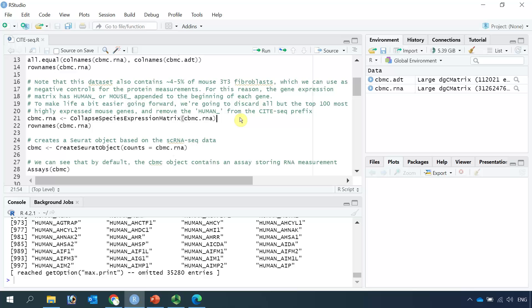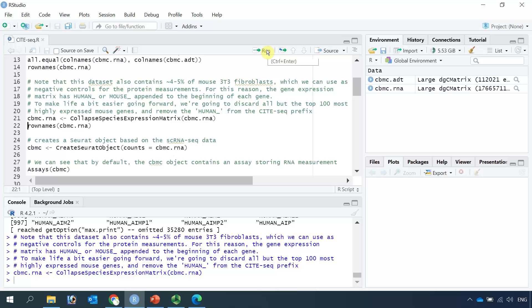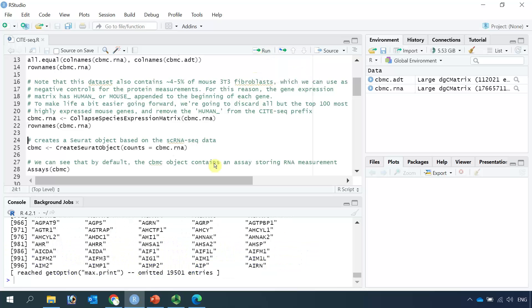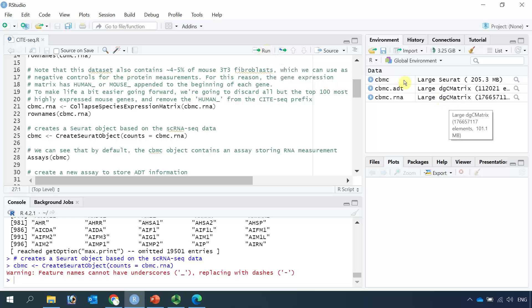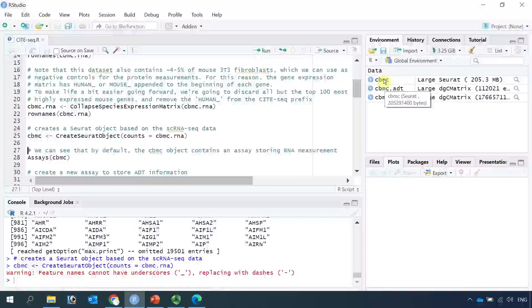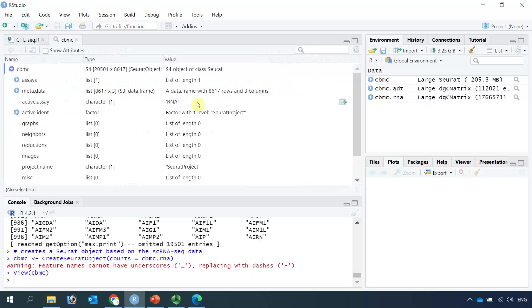If we run this code, we only keep the top 100 highly expressed mouse genes and also remove the human-tag prefix from the CITE-seq data. Then if we look at the row names again, you can see now we just have the gene names. Now we can create a Seurat object for the RNA-seq data, named CBMC. You can see we have a Seurat object now, and at the moment this object only has one assay.